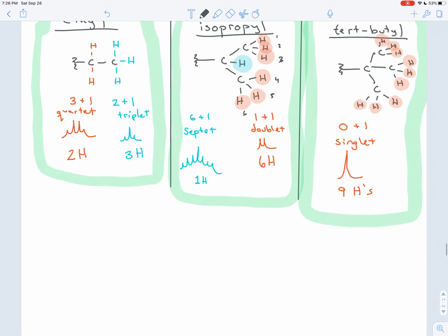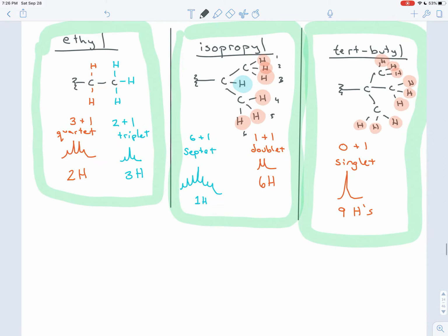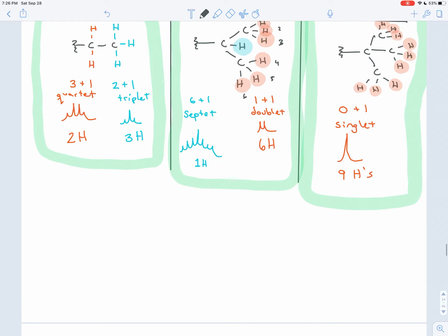Finally, there are a couple other things you'd want to notice, some other patterns that you'll want to see. If you ever have a hydrogen deficiency index, and remember you calculate that by taking 1/2 times 2 times the number of carbons, plus 2, plus the number of nitrogens, minus the number of halogens, fluorine, chlorine, bromine, or iodine, and minus the number of hydrogens. If that number ends up being 4 or bigger, chances are you have a benzene ring.